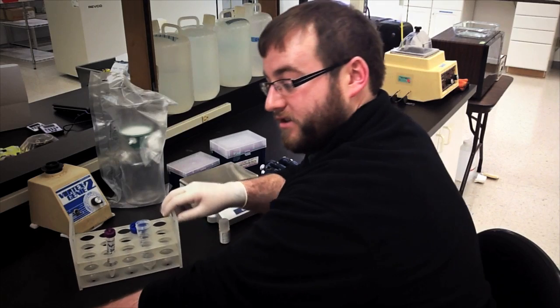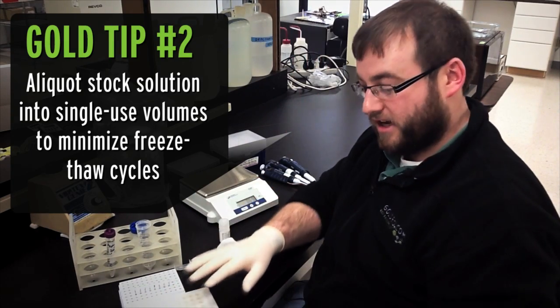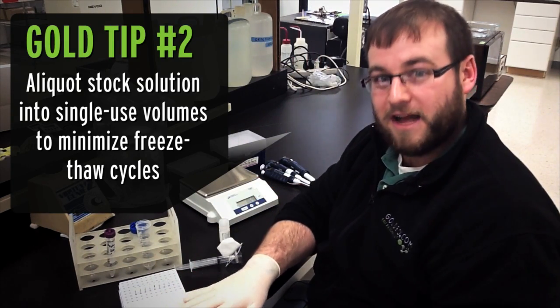This solution is stable at minus 20 for about a year, but you'll want to minimize your number of freeze-thaw cycles. A good way to minimize your freeze-thaw cycles is to aliquot your solution into smaller volumes, typically in Eppendorf tubes.